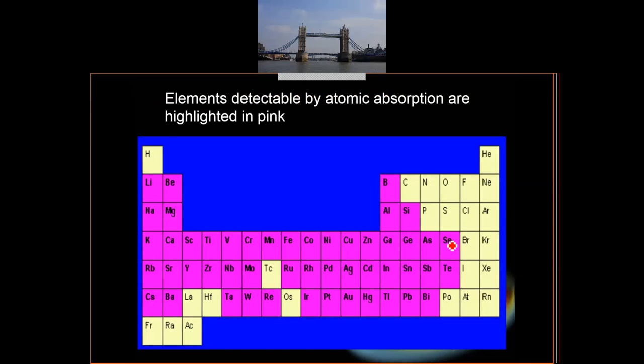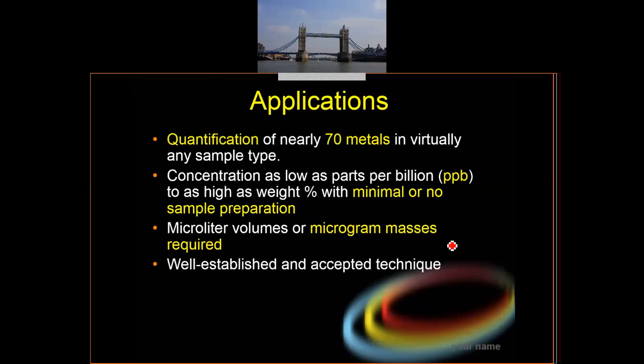Okay. So what's the application? To detect metal, to detect any metal that we can find in food, and put it on the label. How much sodium does this certain product have? We don't know. We need to analyze it. And this is the machine to analyze the amount or the presence of sodium, the presence of aluminum.